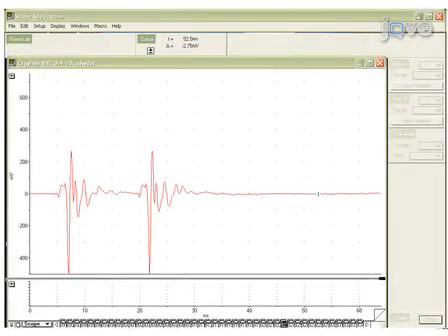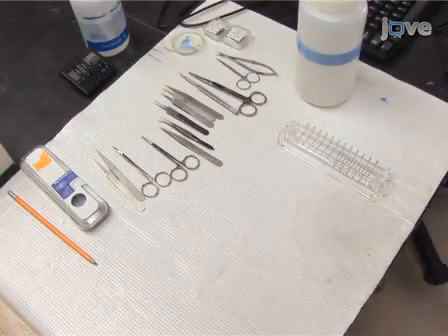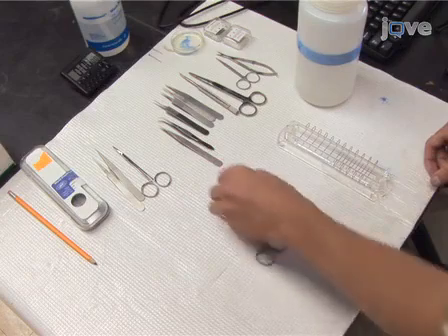When signals travel along the crayfish ventral nerve cord with different conduction velocities, the fastest ones will be observed first, and the slower ones will be observed slightly later. Some of the signals will summate in the recording depending on the population of axons with similar conduction velocities. This summated electrical signal from the multiple axons is referred to as a compound action potential. The next series of experiments focuses on recording compound action potentials from crayfish nerves.